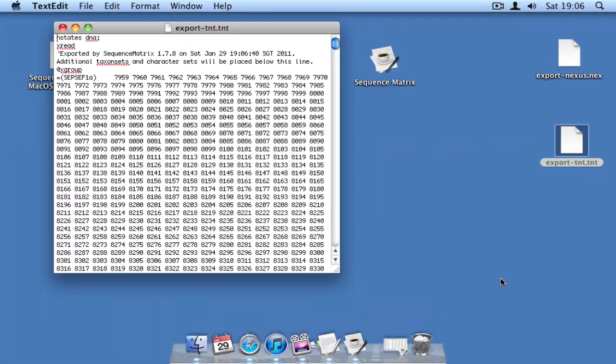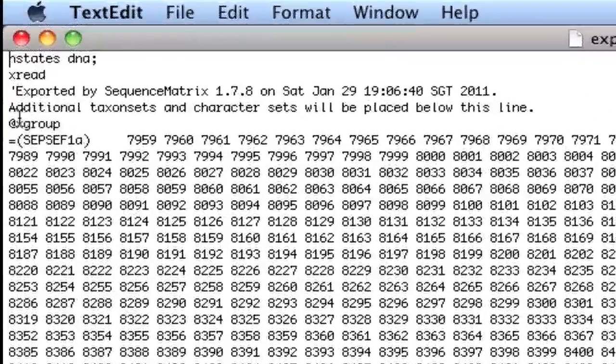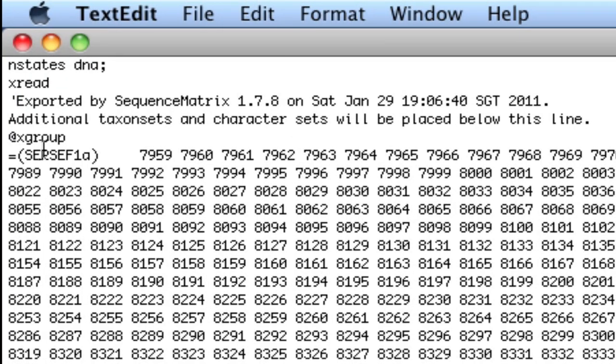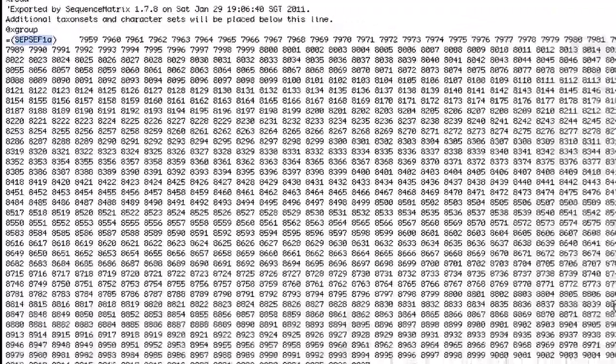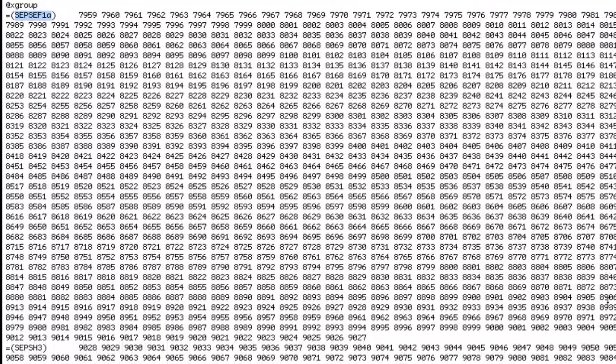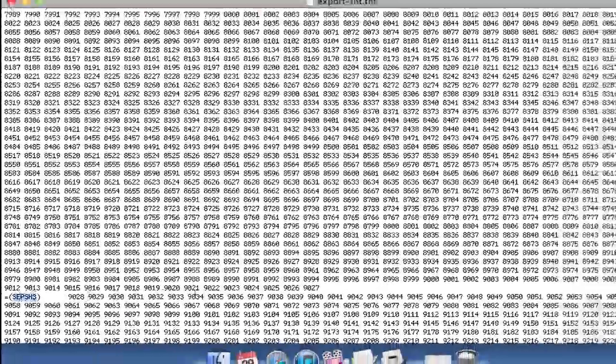The extra characters have been put into one large comment, which extends from the top of the file to the start of the data. TNT will ignore this data, but Sequence Matrix will be able to interpret it if you want to re-open the file and re-split it.